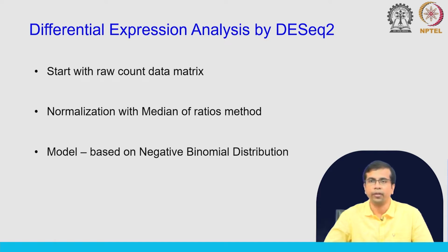So, this is a parametric method, it has some assumption about the count data distribution and it models them using this negative binomial distribution, and then it fits a generalized linear model. It takes that approach to estimate the parameters, the coefficients that are fit in the model. Those coefficients give us the mean expression values of the genes as well as the differential expression.